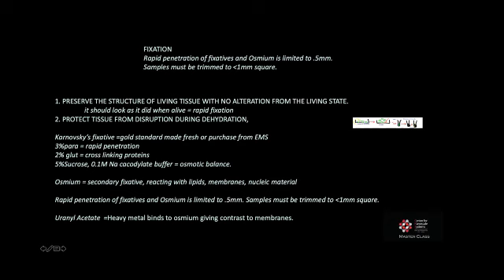So again, our goal is that this preservation of the structure looks as it did when it was in the living state. We want no fixation artifacts, and that happens when you fix rapidly. This is also how we protect the cells from disruption during the dehydration phase.